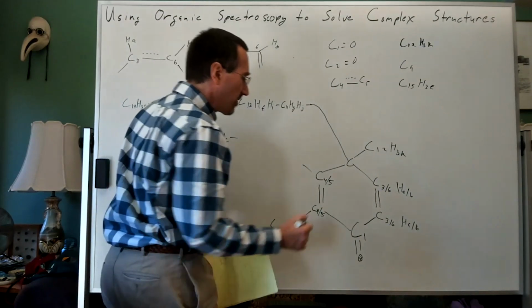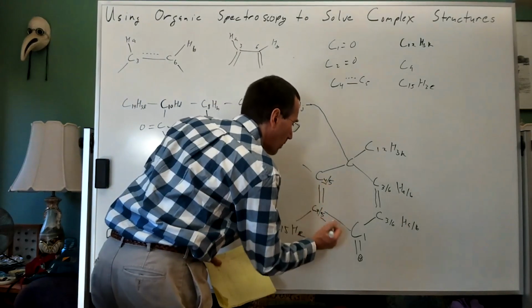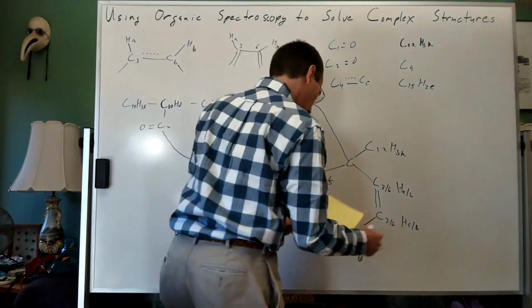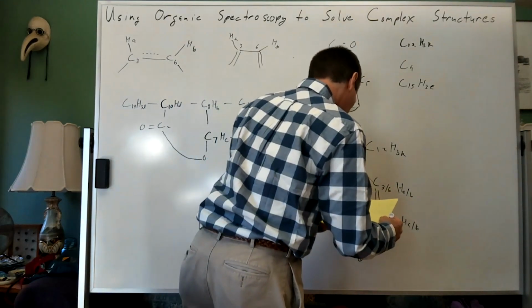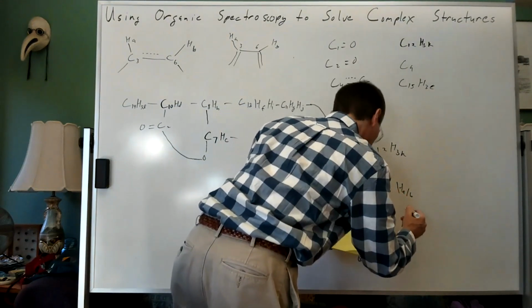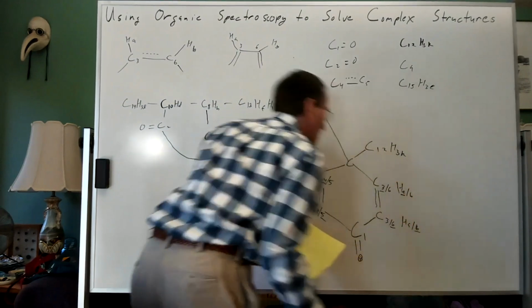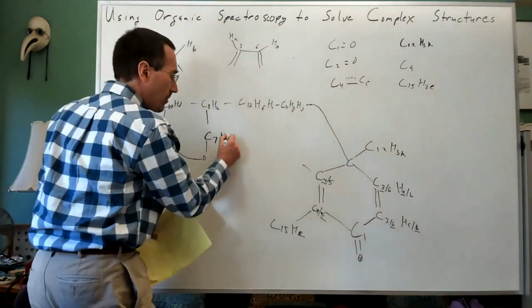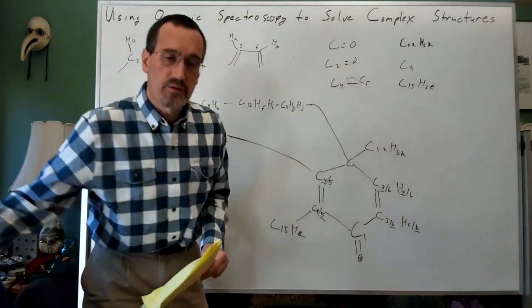Because at this point, first of all, now we've assigned our carbons. This is number 4. This is number 5. It's crossed with, I think I said 3. So this is number 3. And its proton is A. This is number 6. Its proton is B. And we have 2 valencies. We put our structure together over here.